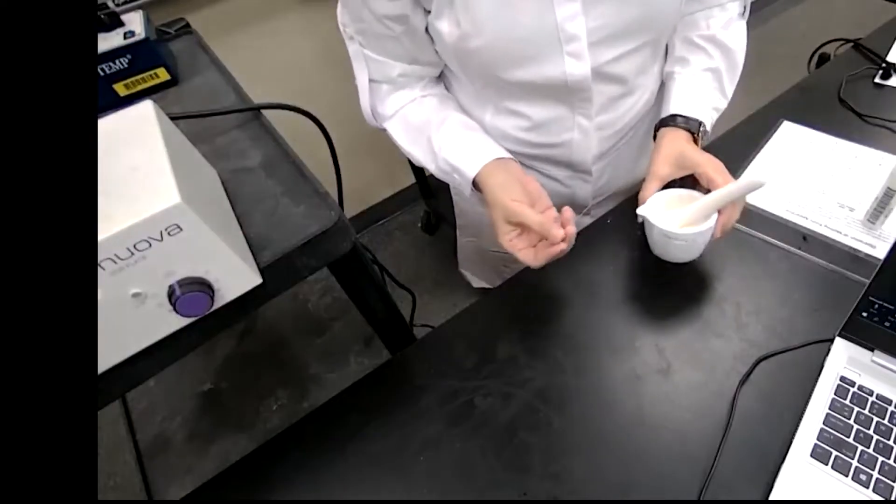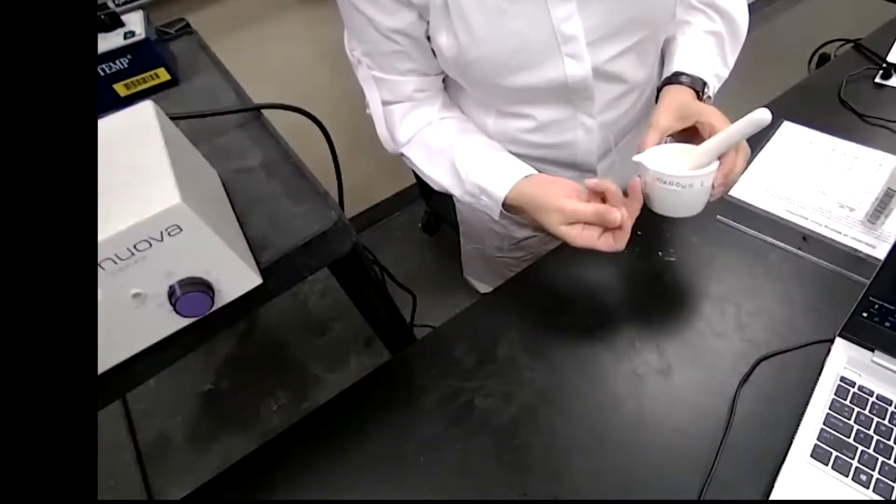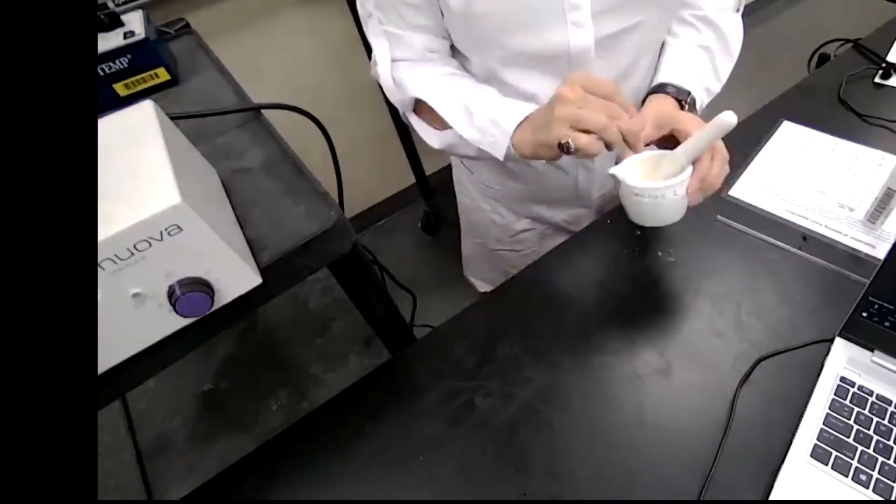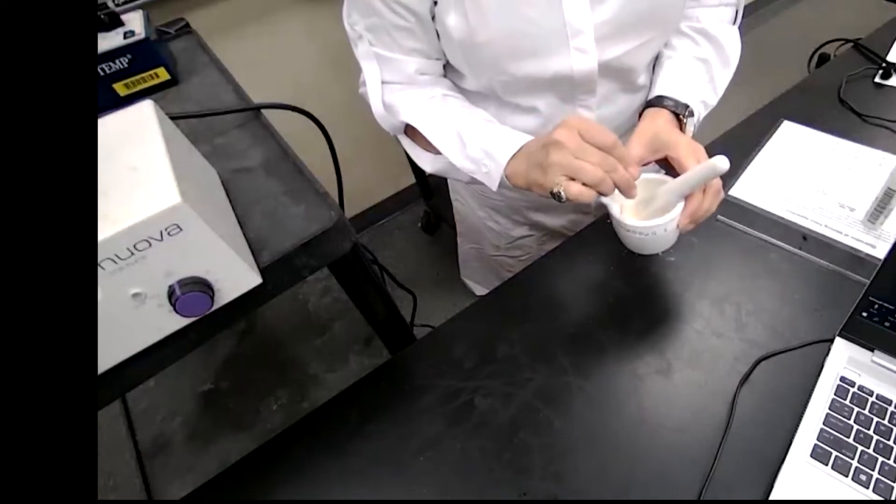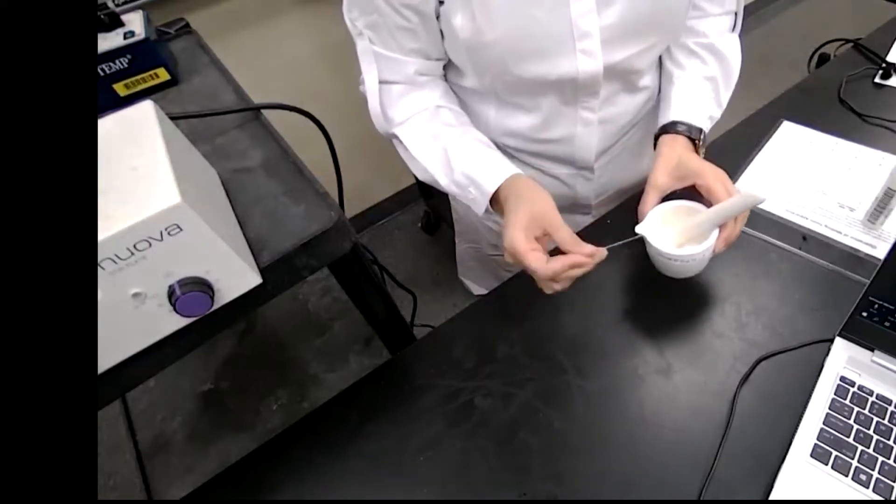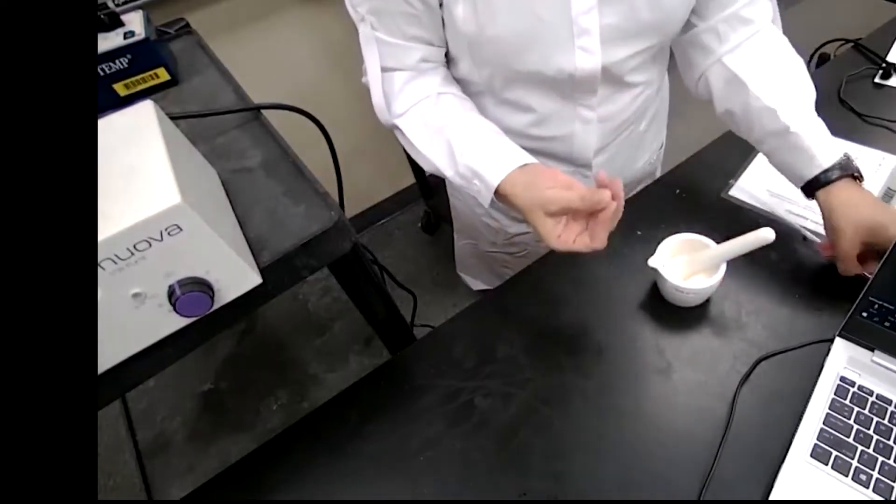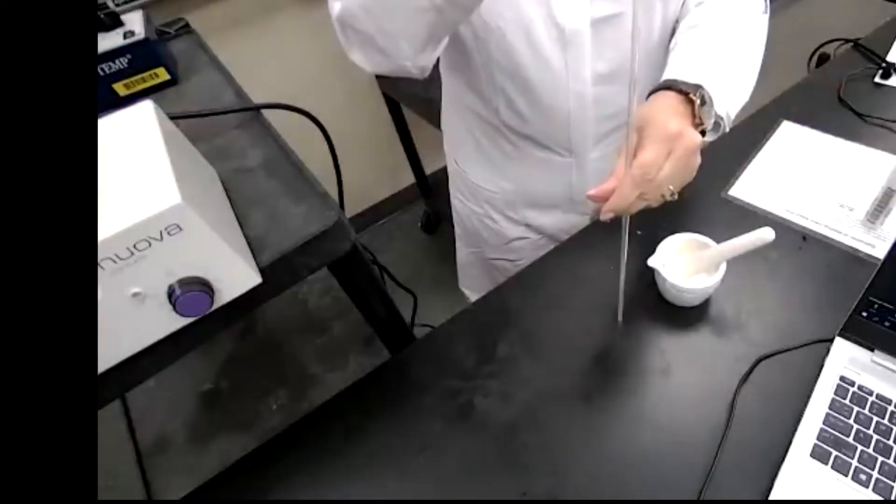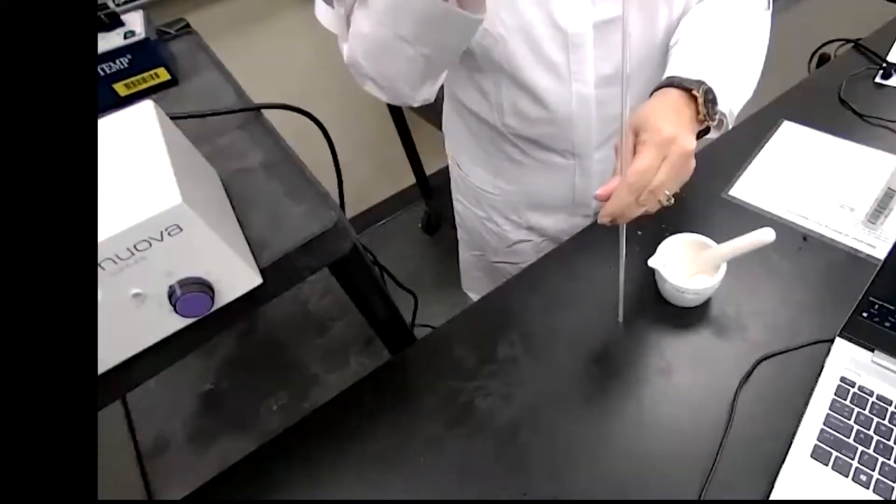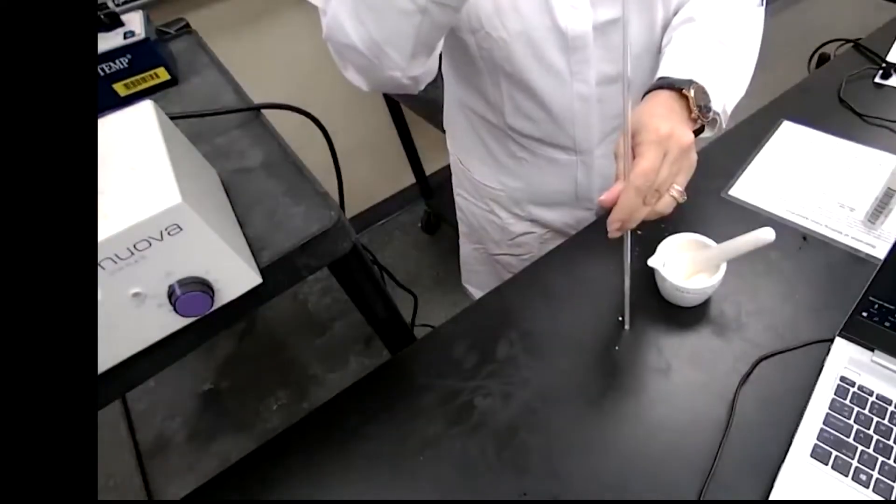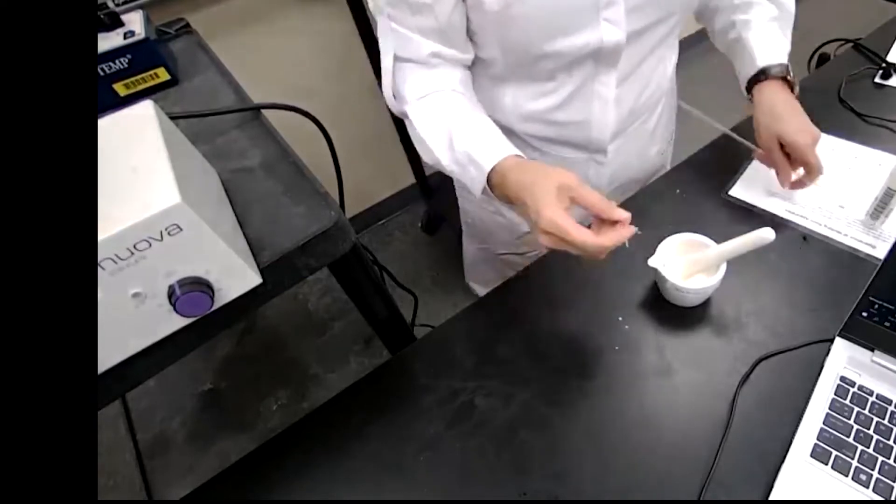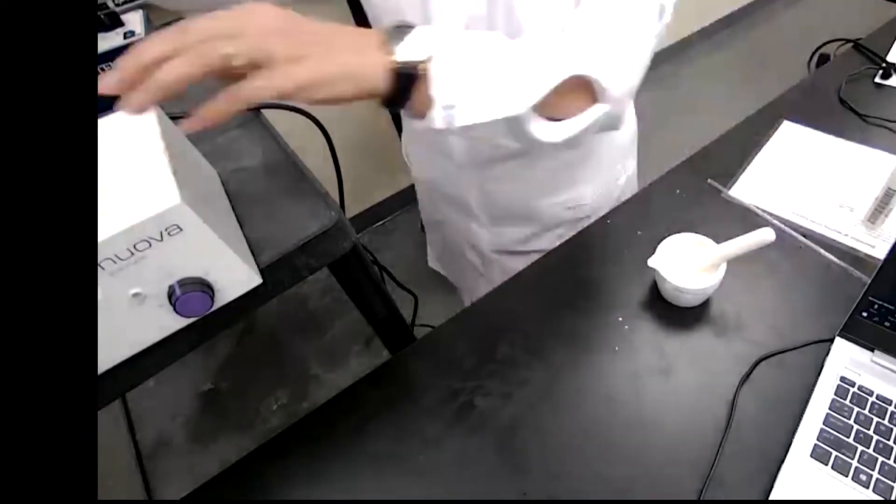We have our unknown number two now. And again, because it's unknown, we don't know the approximate melting point. I'm going to do a quick sample to get the approximate melting point for this sample first. Then I would do a second sample to get the real melting point of the unknown.